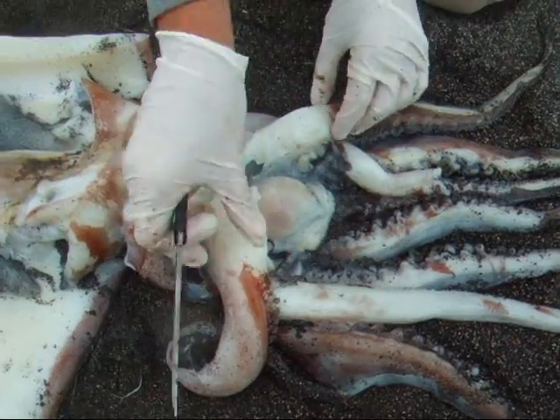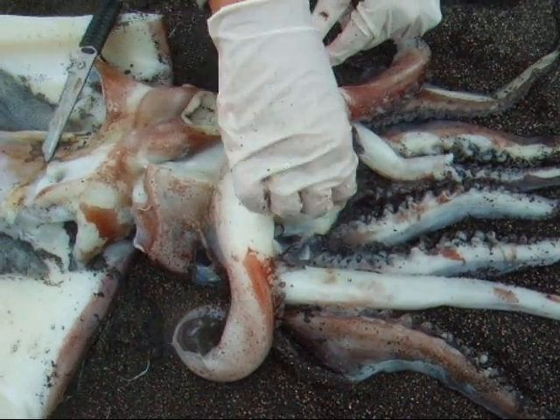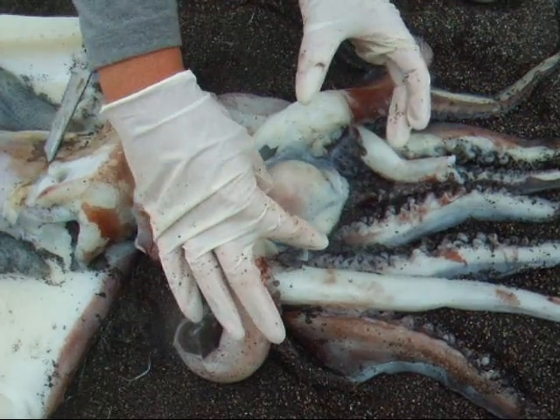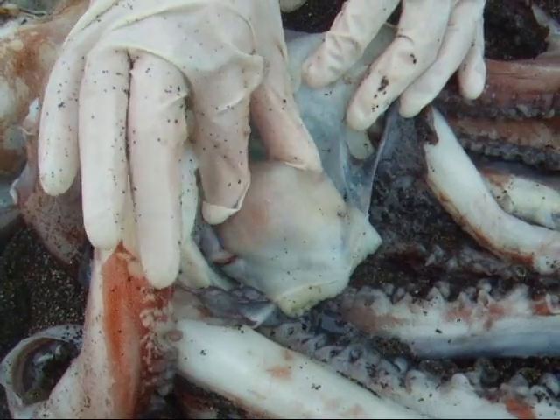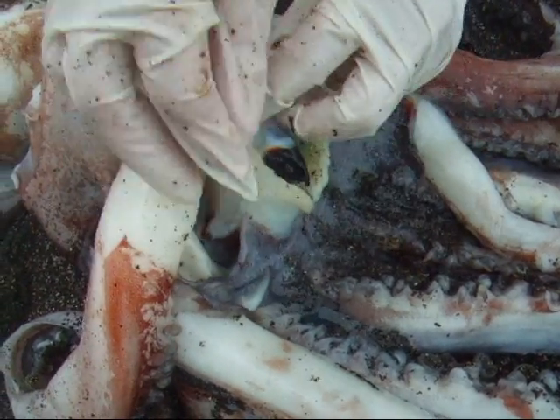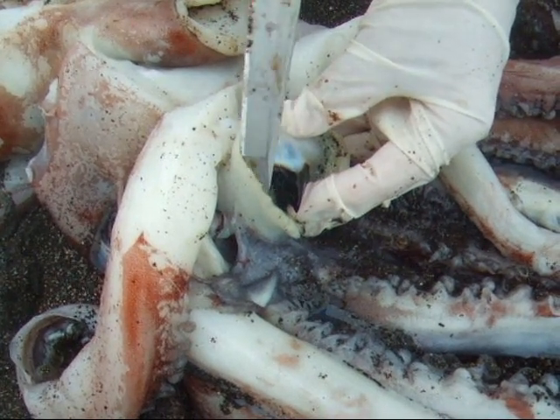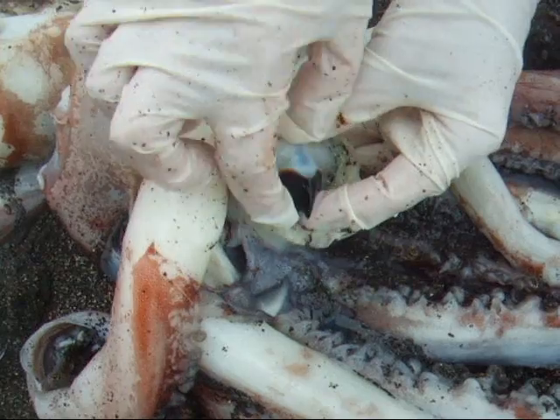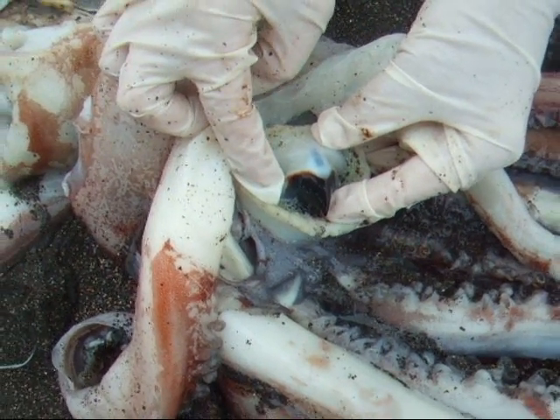I've gone ahead and cut open the buccal cavity. As you can see, it's large and all this mass right here is all muscle. And if we look inside, there is a hard structure. What is this structure, and what is it made out of?